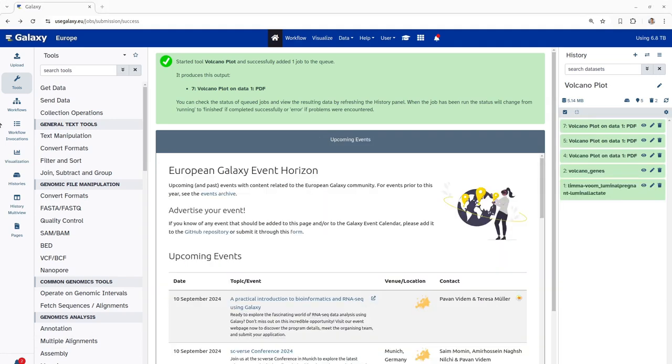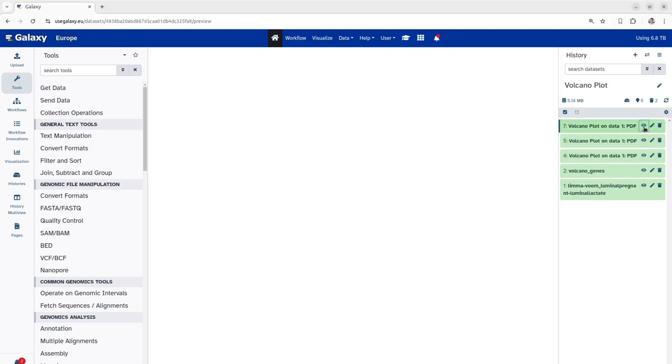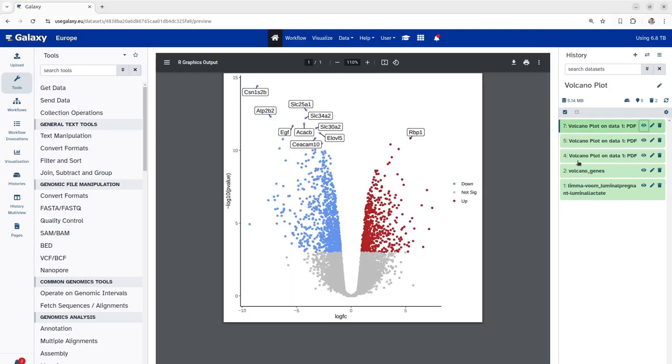This is now complete and let's see the results of our volcano plot. As you can see here, the genes have been labeled according to our genes of interest holding some statistical significance. Similar to our previous plot, the blue dots represent the genes that are down-regulated and the red dots represent the genes that are up-regulated.